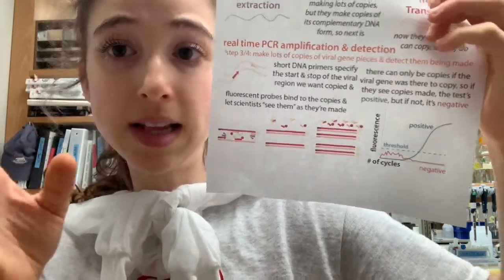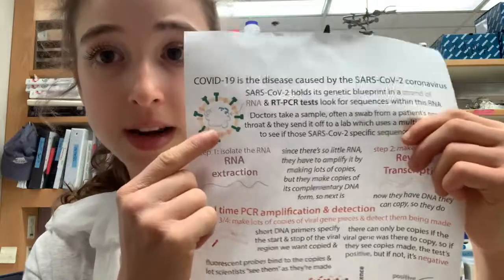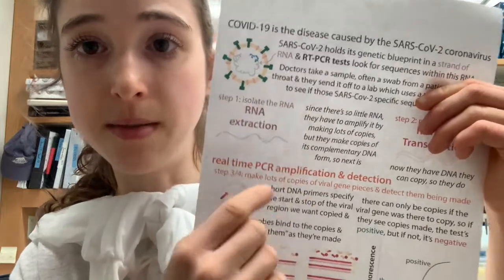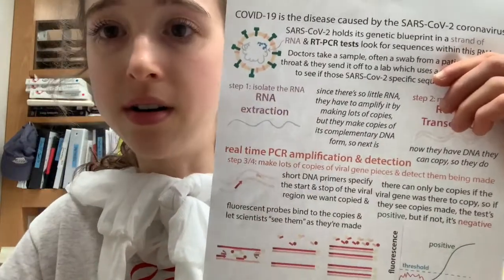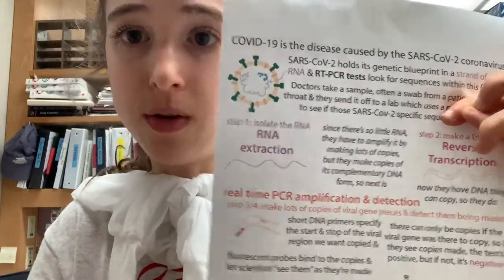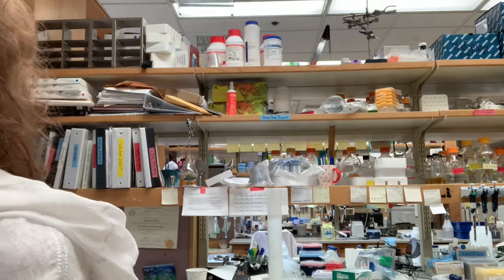And so some people try to look at CT values to determine if a person is likely infectious or not anymore. Because remember, this is detecting the viral RNA. It's not detecting live virus. So it's very likely that there is live virus, especially if you have a low CT count. But what we're detecting is actually just the viral RNA, which is why you can detect dead virus on surfaces and that sort of thing that isn't actually harmful. And so sometimes this RT-PCR is actually too sensitive for its own good. So let's get into the details a little more now.